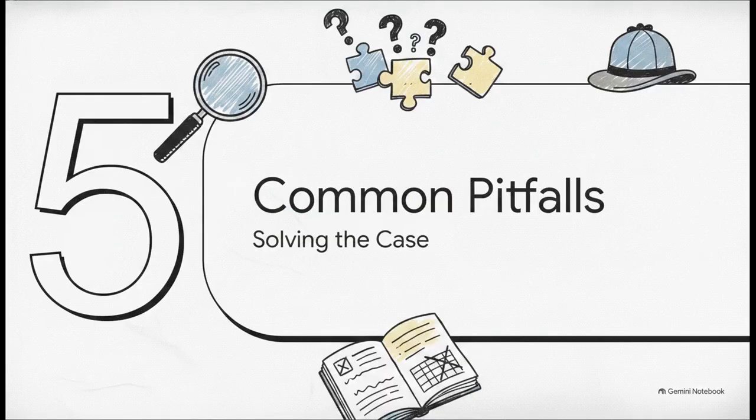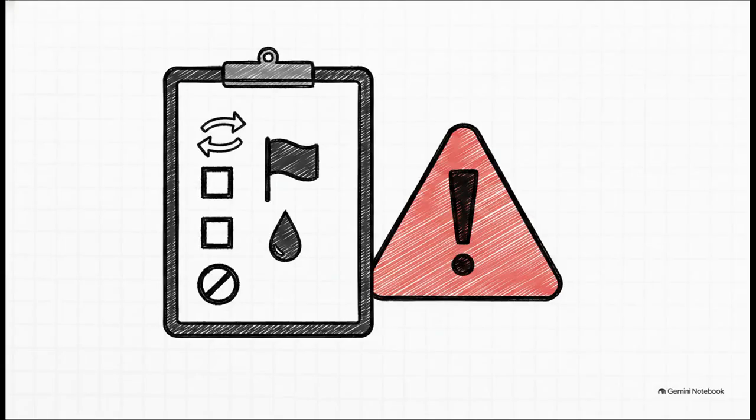All right, we are in the home stretch now. Section 5, Common Testing Pitfalls, Solving the Case. Let's take everything we've learned and make sure we don't get tricked by the data. So the crucial point is you now have an actionable checklist to use the very next time you look at a lab report. Do not compare units without doing the mathematical conversion. Do not ignore those tiny little letter qualifiers next to your numbers. Never forget to ask about dilution or sample mass corrections. Stop assuming that not detected equals an absolute 0. And please be incredibly careful about mixing different methods or comparing detection limits between two completely different laboratories.